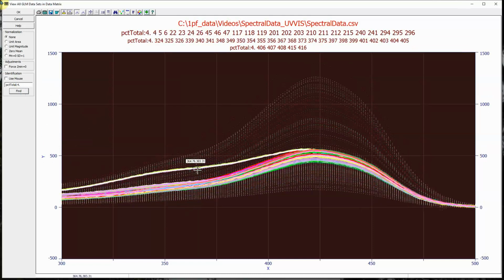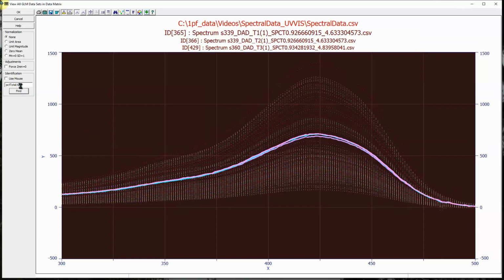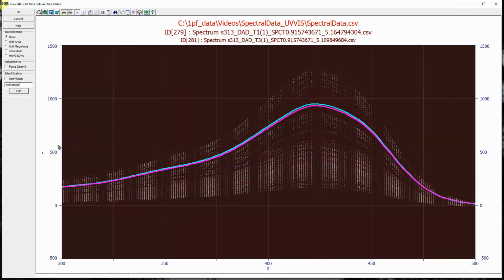And here you do see the divergence of those bracketed samples. These exist because the ratios of the 3 components are drastically different in these particular samples here. So far we see a case where we're tracking very well, and the tracking appears to be out more toward the right side of the overall spectral feature. But this will continue as we go through here. We see what looks to be a lovely modeling problem because it looks like one or just a few spectral values will be giving us the trends that we need to do the effective modeling.